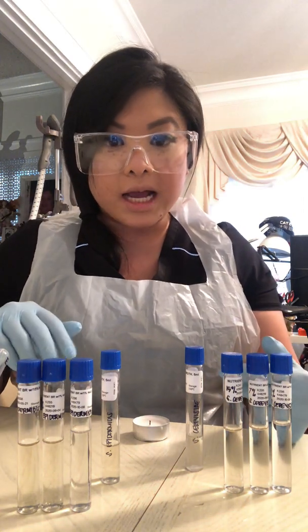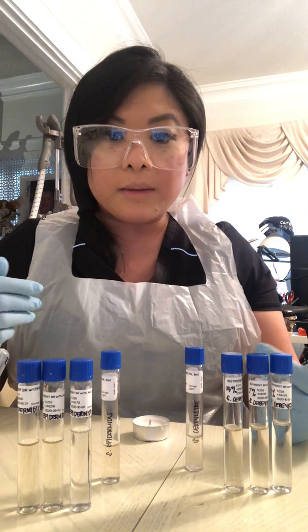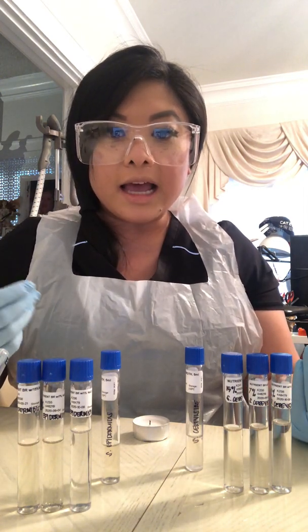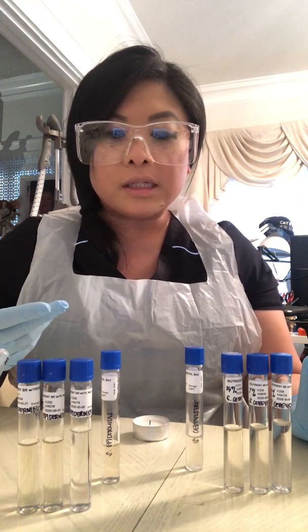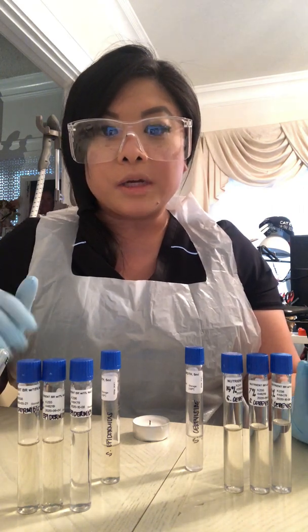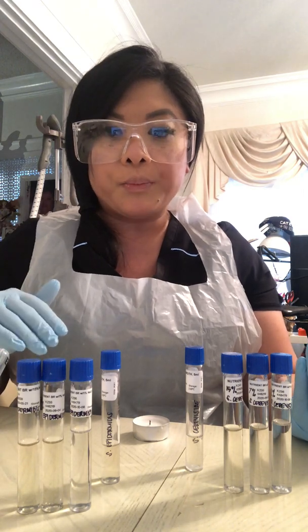For this exercise, this is the first one, the salt tolerance test. In this lab, I will be incubating the S. cerevisiae and the S. epidermidis culture broths, which contain different salt concentrations, to determine an approximate osmolality range for each microbe.